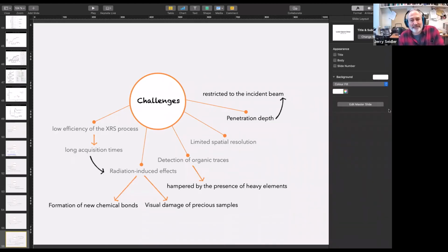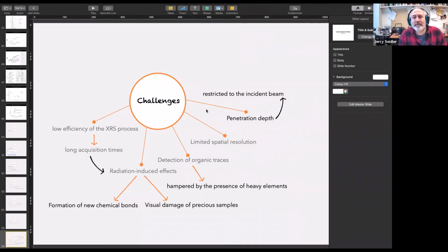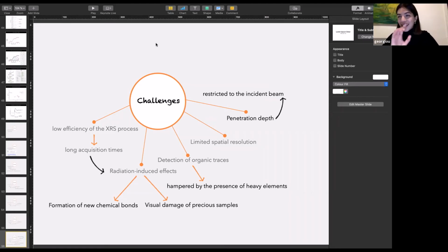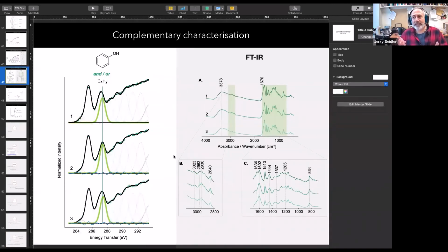Okay, thank you. Another question for Rafaella. What do you see as the best way that the Raman scattering complemented the FTIR in that second study? Excuse me, could you? I'm sorry, I was in the chat. So you showed the FTIR as a complement or a check on the Raman, and I wanted to understand what their relative merits ended up being for this kind of study. Did you need the Raman, or was it a second analytical determination?